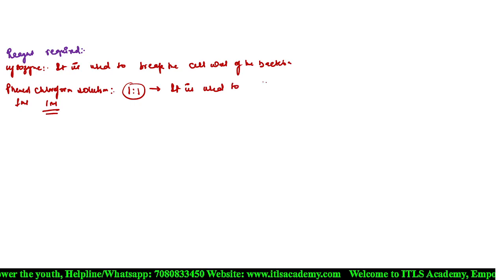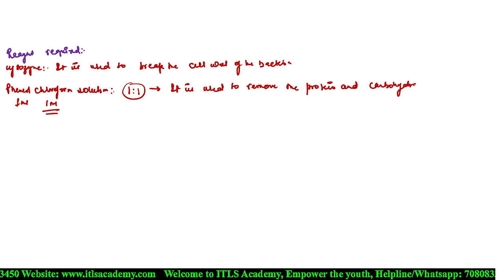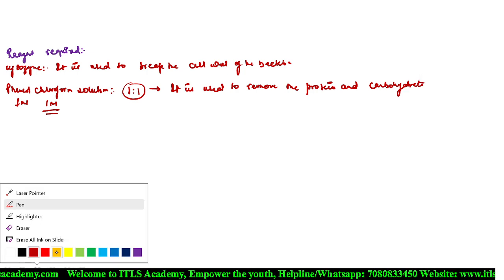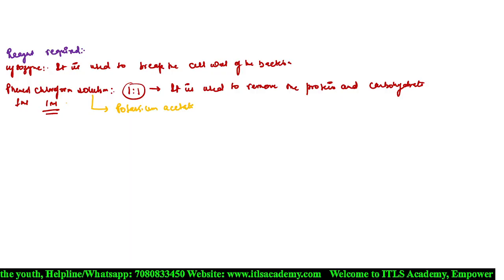Sometimes in place of this phenol and chloroform solution, we can also use potassium acetate.